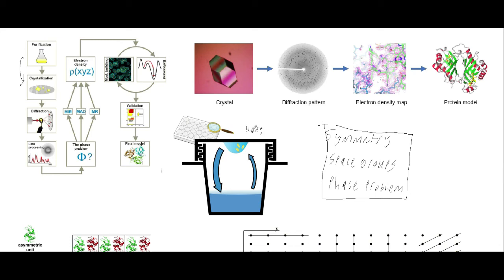We have our protein in a solution, and then we put a small drop of it onto a cover, and then place that cover onto a well, and it'll usually be in a multi-well plate like this. This is looking at a single well. We have in the drop our solution with the protein. Then down here we have our solution absent the protein.